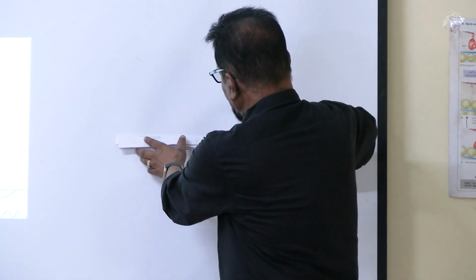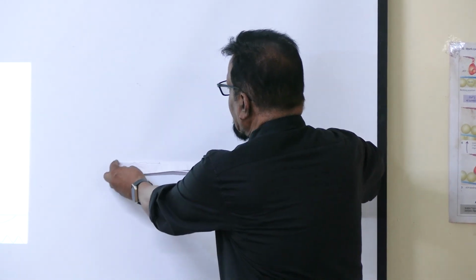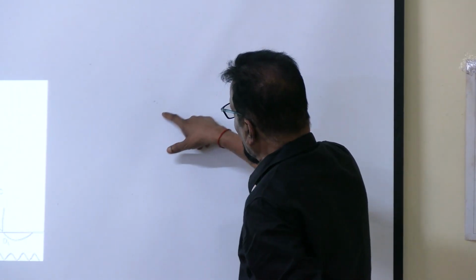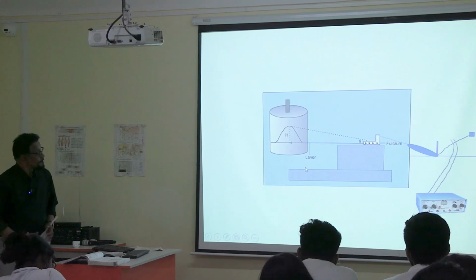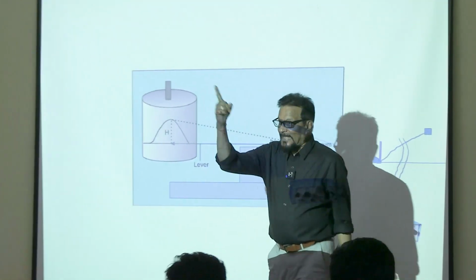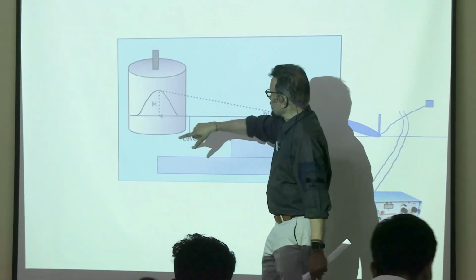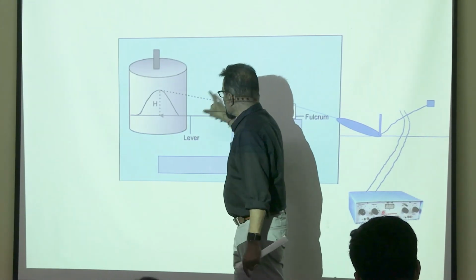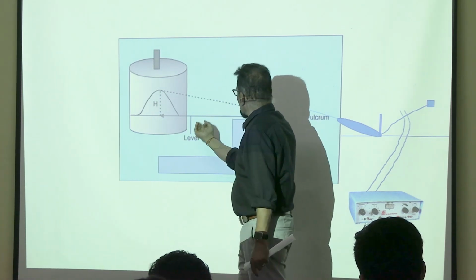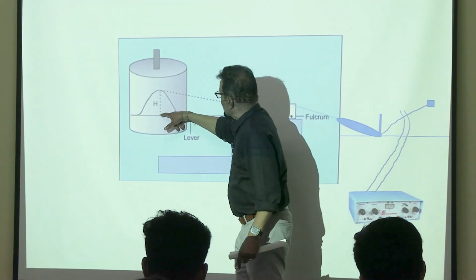So here is a fulcrum. Now if it moves like this, what will you get? An arc or a straight line. Actually, these lines are drawn with the stylus. After completion of the graph, the drum is moved to the center position, and an upward stroke is made so that it will make a line.